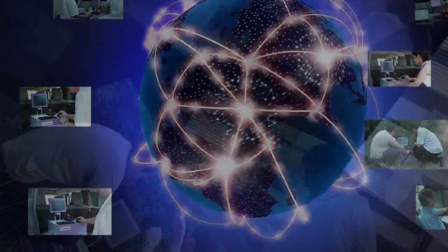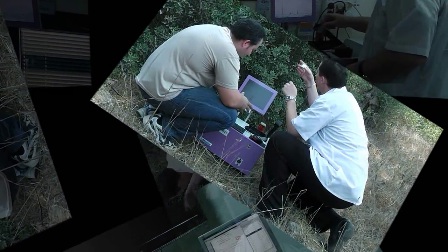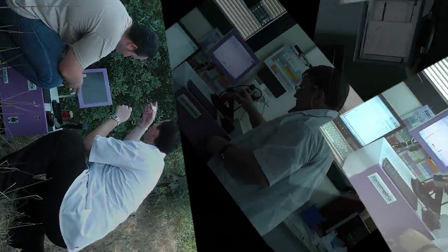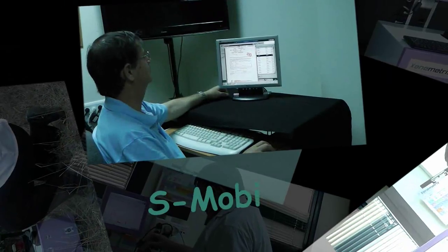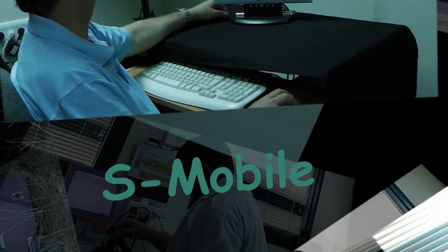With proven performance, high reliability, and friendly design, the S-Mobile has a unique contribution for redefining the concept of X-ray fluorescence analysis and field use and has created a large global community of satisfied users.